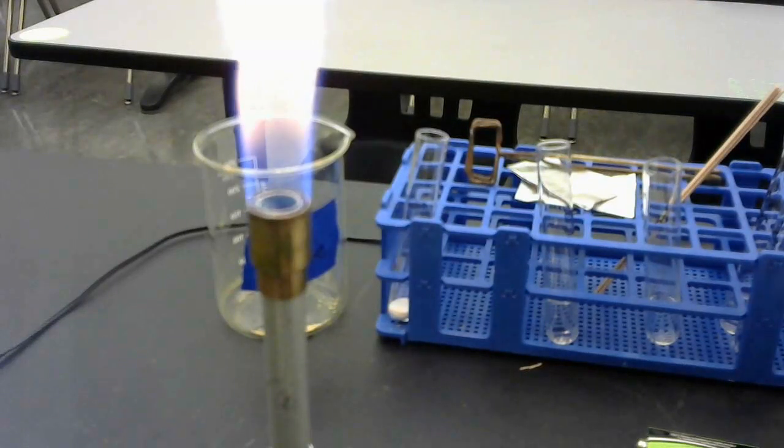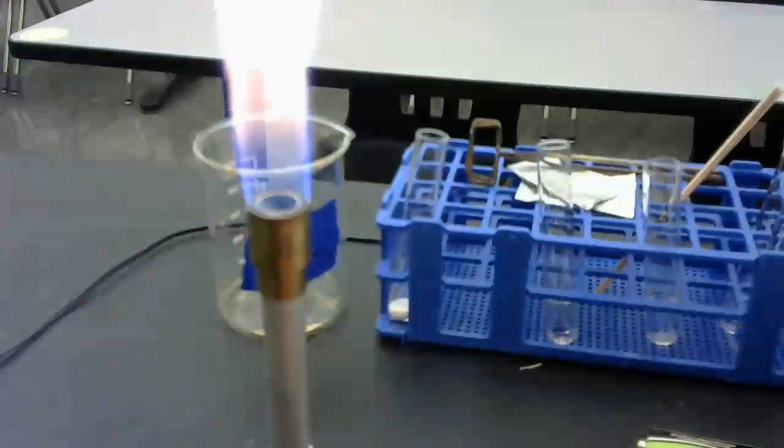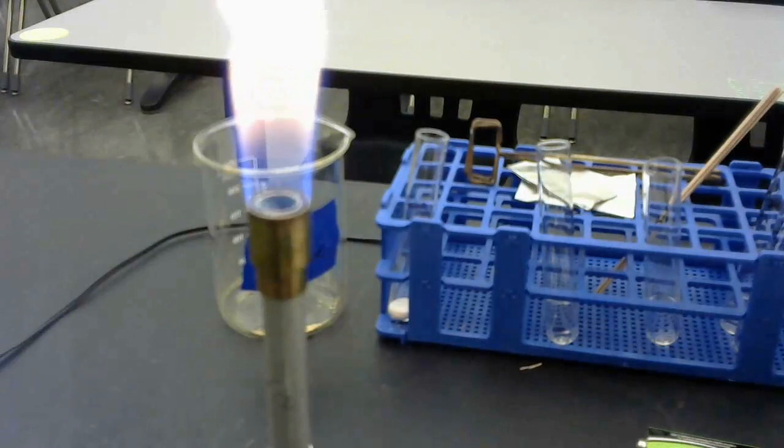And then for your waste in those cases, you can just put your waste in the little Dixie cups, and then you can throw those away when you're finished with the lab, okay? Now we have reaction part 3.